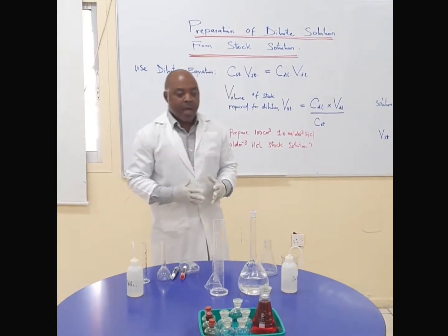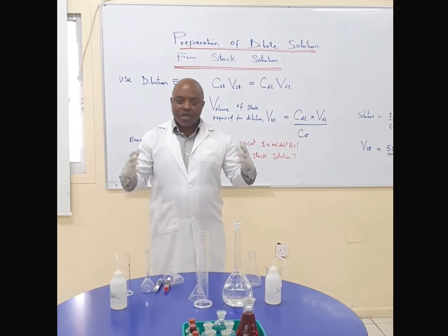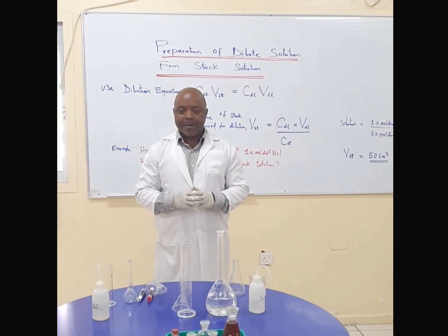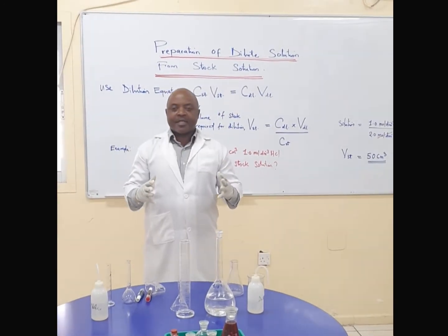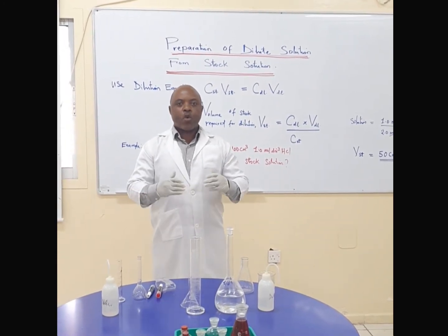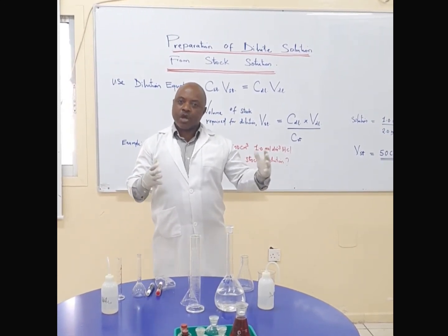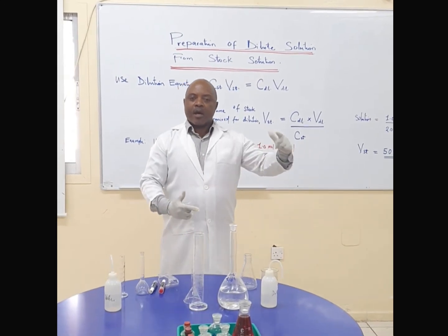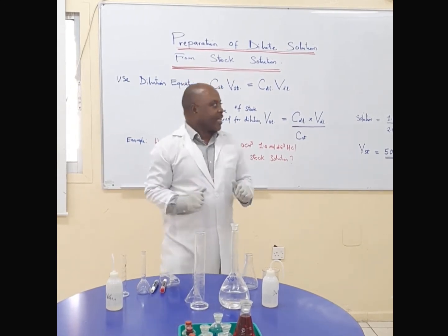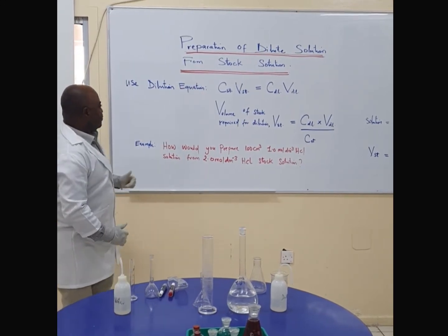Thank you very much. I just want to give you a brief demo on how you can prepare a dilute solution from a stock solution in the laboratory. You know that for sustainable use of lab resources, it is always advisable to prepare dilute solution from standardized stock solution rather than preparing standardized solution over and over. I just want to give you an example of this: preparation of dilute solution from stock solution.